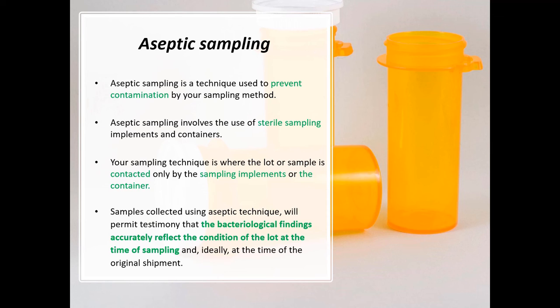So you've done your sterile sampling technique. You've utilized aseptic technique also. Therefore, you as the sampler have not introduced any other bacteria into the product that's under investigation. So your results in the lab are now true to that product.